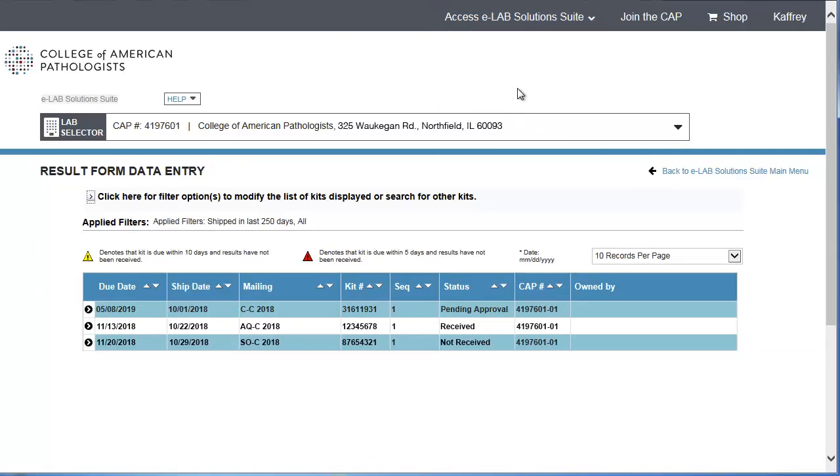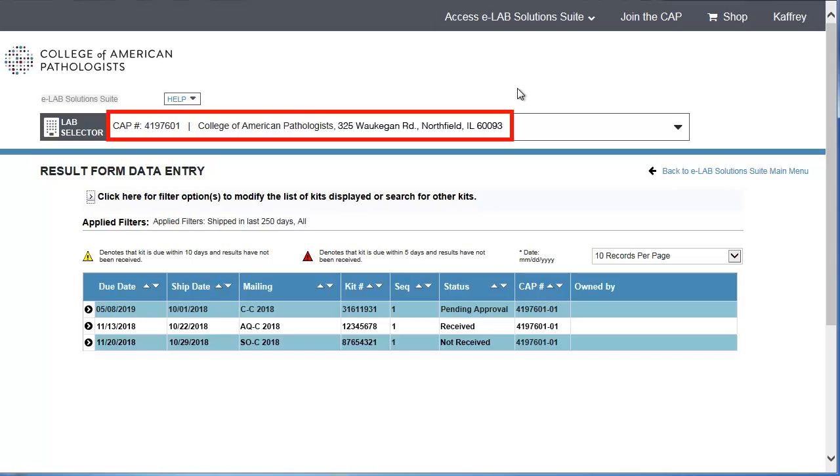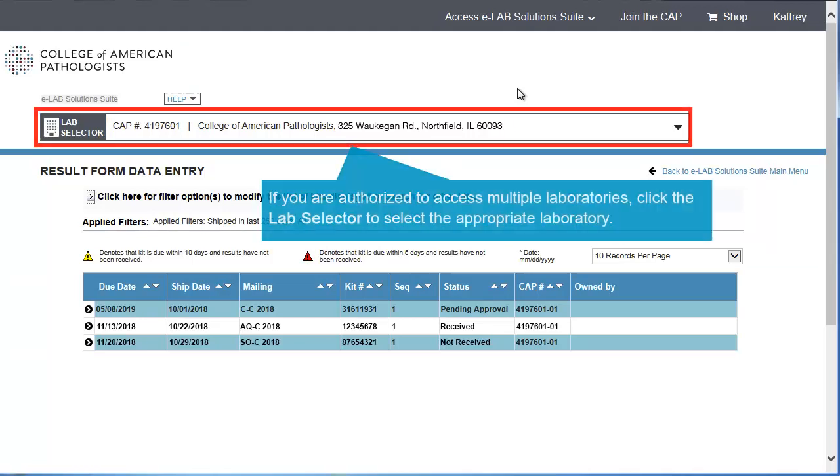The Result Form Data Entry screen appears. If you are authorized to access only one laboratory in eLab Solutions Suite, that laboratory's information appears by default. If you are authorized to access multiple laboratories, click the Lab Selector to select the appropriate laboratory.